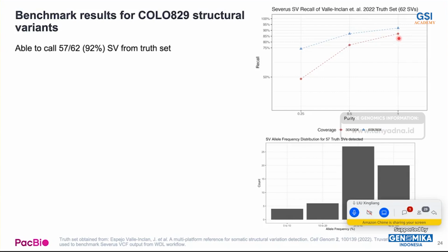the recall rate. Of course there is some drop in performance, but that is mainly because of the number of reads supporting those regions. There is a caveat I want to share with you. When you're doing SV analysis using long read sequencing data, one thing we need to take note of is that, given similar comparable coverage, short read sequencing data will have many more reads compared to long reads, because our read span is much longer, right?